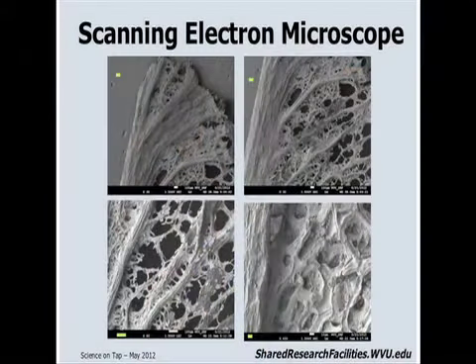And biological samples are usually non-conductive. They won't let the electrons move. So usually they have special treatment before being put in the microscope. And basically this is how you observe an image in the electron microscope. We call it scanning because, like in the profilometer, I'm making a map and observing the surface. So I'm scanning the entire surface.